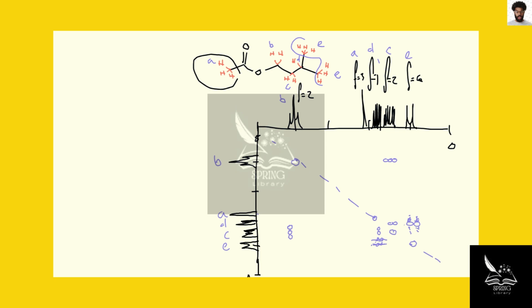Wow, it's kind of long, but hopefully you get the idea. You just take the 1D NMR, copy it up and down, and then anywhere there are two signals that interact, you draw whatever the effect of that is on the plot at the point where they meet.